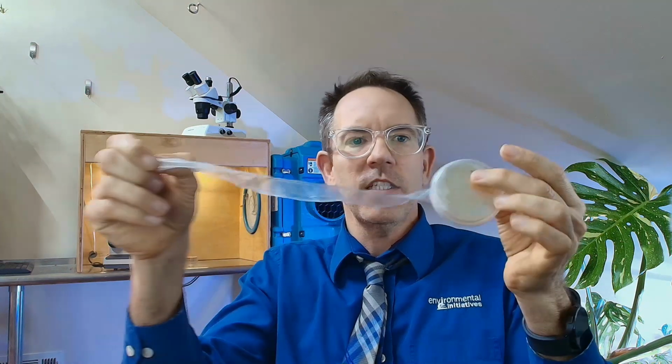So what are these contact plates? We make these in our own lab, and anyone could. I think we're the only ones that do make them, but I love them. They're small, they're yay big, right? If you get them from me, they're going to be wrapped in a little piece of wax, and that helps so it doesn't dry out. So you'll just take this little wax off.